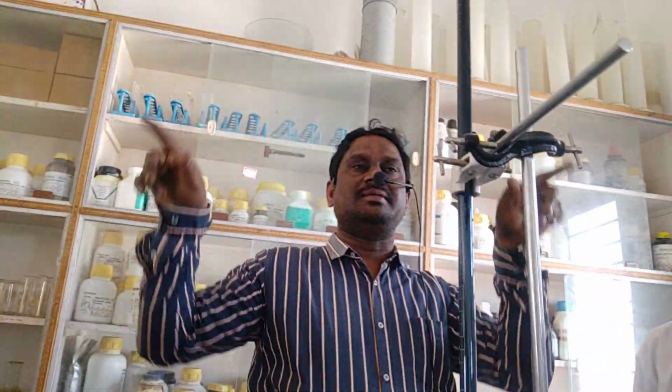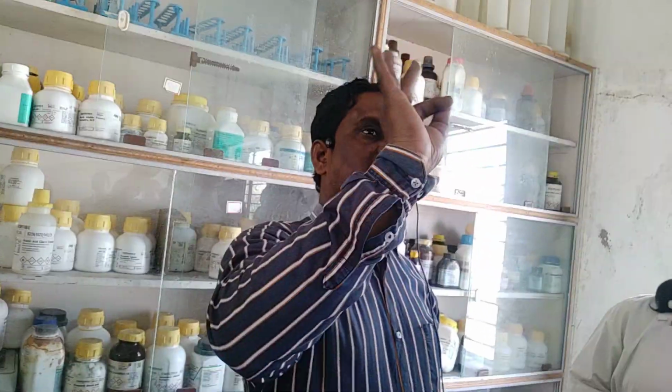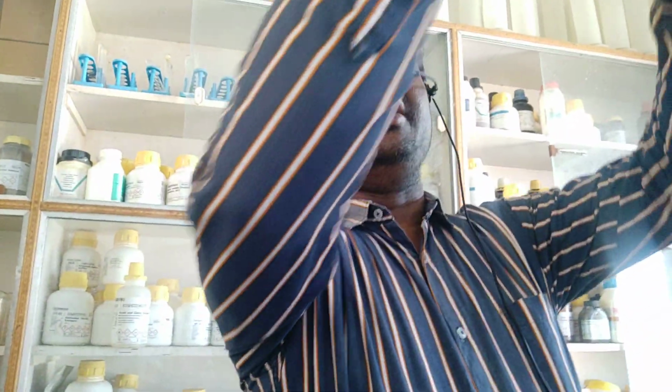See, one table is there. The table is there or not? Burette reading: first one, second one, third one. 3 times you have to perform the experiment. First, the initial reading is there. What is the initial reading? You have to keep the values.